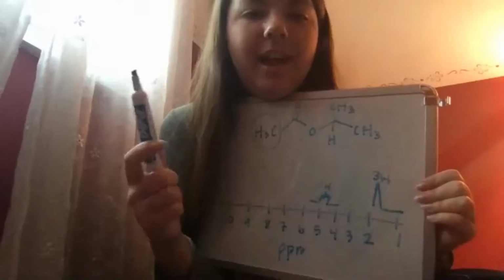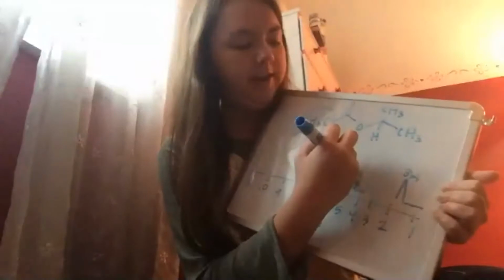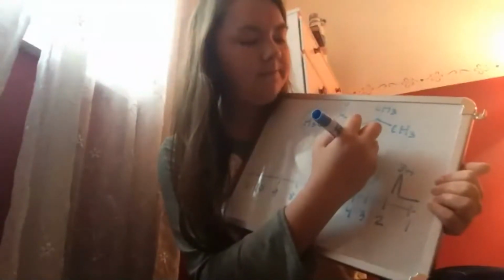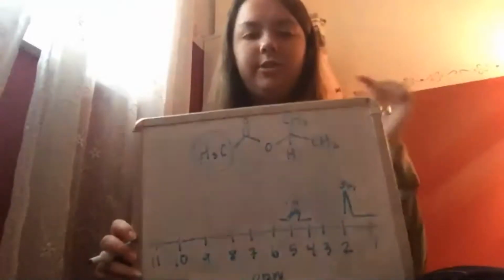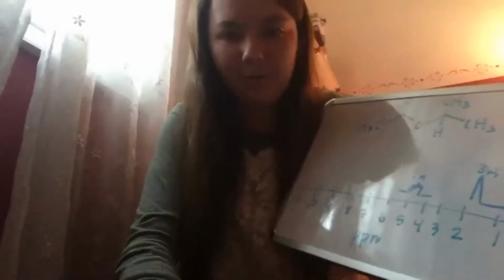Now, if you are asked to draw this, what I would do, Michaela, is expand from 1 to 7. A lot of times they'll have something up above where they show it's like 7 peaks. Even so, if you say it's a septet, I would understand. Also, it's easier to do when you're actually writing on paper than with a dry-erase marker because it's more detailed. As long as you get the idea, that's the important part.